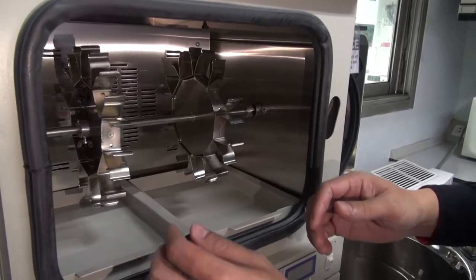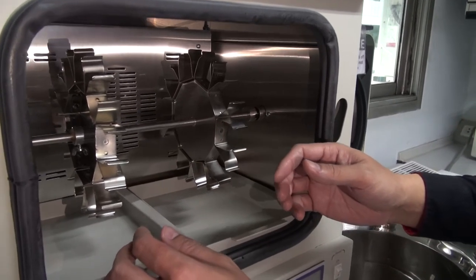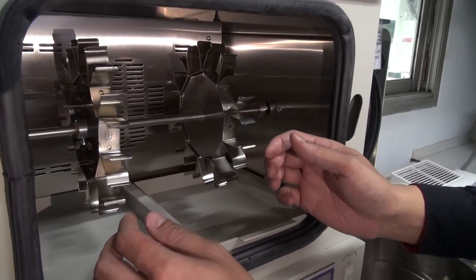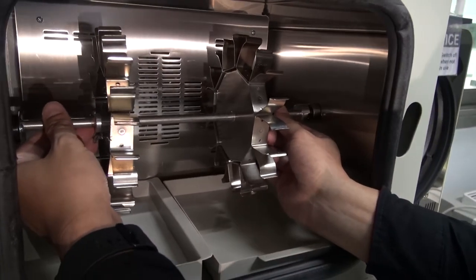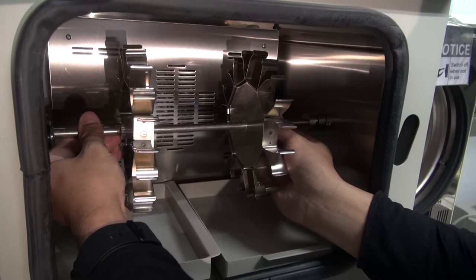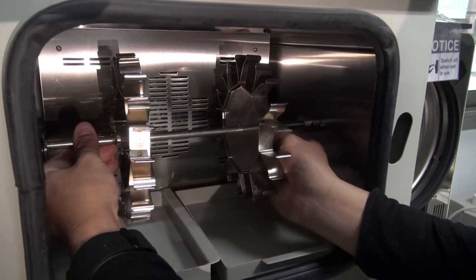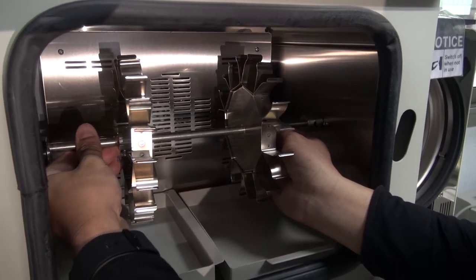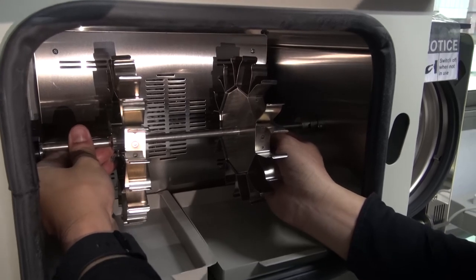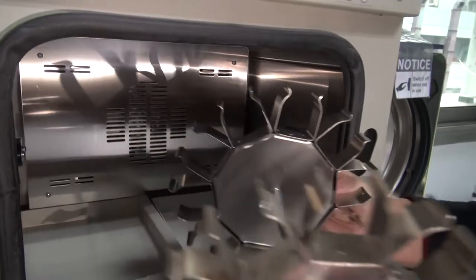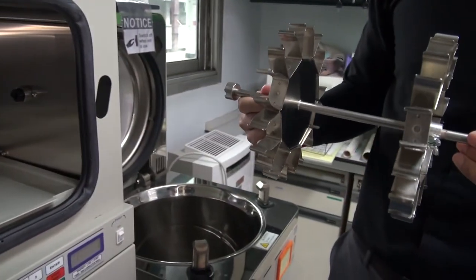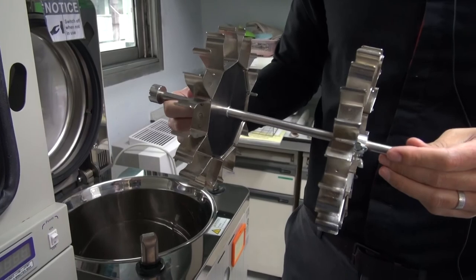To remove bottle carousel assembly from the unit, press the shaft of the carousel against the right side. Then simply pull the left shaft out from the holder and then take the whole assembly out of the unit as shown here.